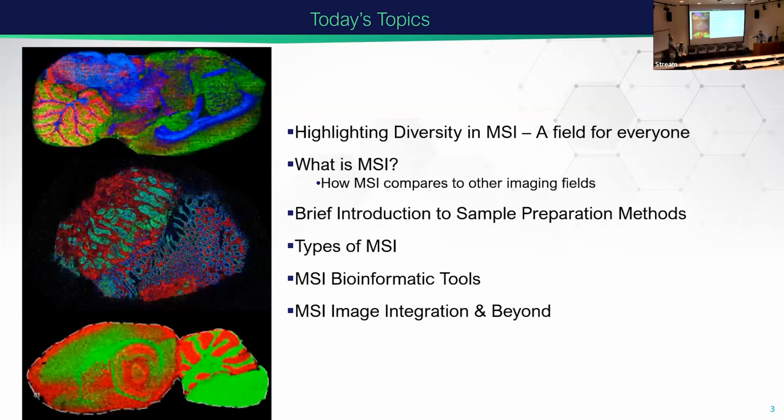You might have noticed that there's another workshop after this from 10 to 12 where we've got a lot more details on tissue and sample preparation, and there is room in that workshop if you're interested in attending. After that, I will talk about bioinformatic tools and how they fall in the MSI pipeline. It's a constantly evolving field, so you may also argue with me or ask questions about how we think about the ways we process mass spec imaging data.